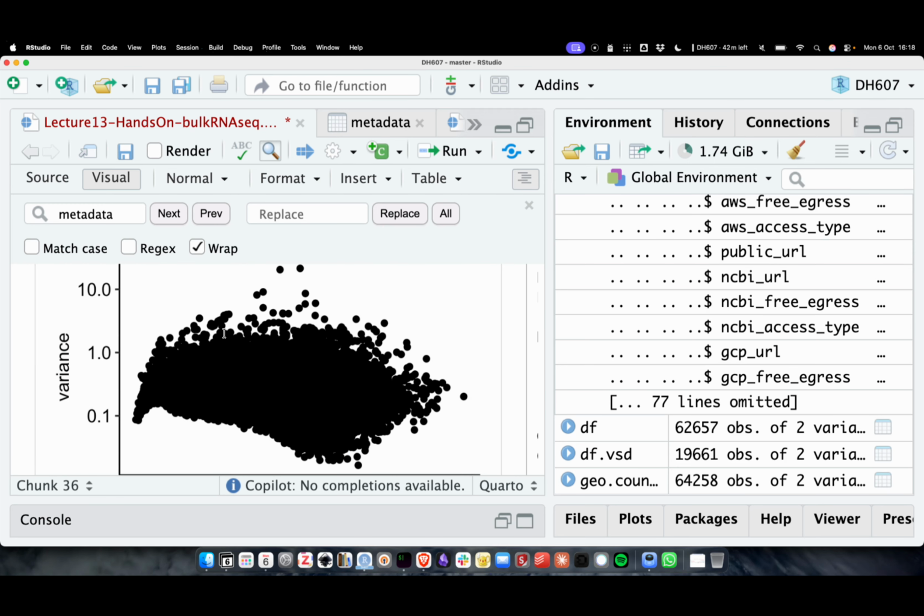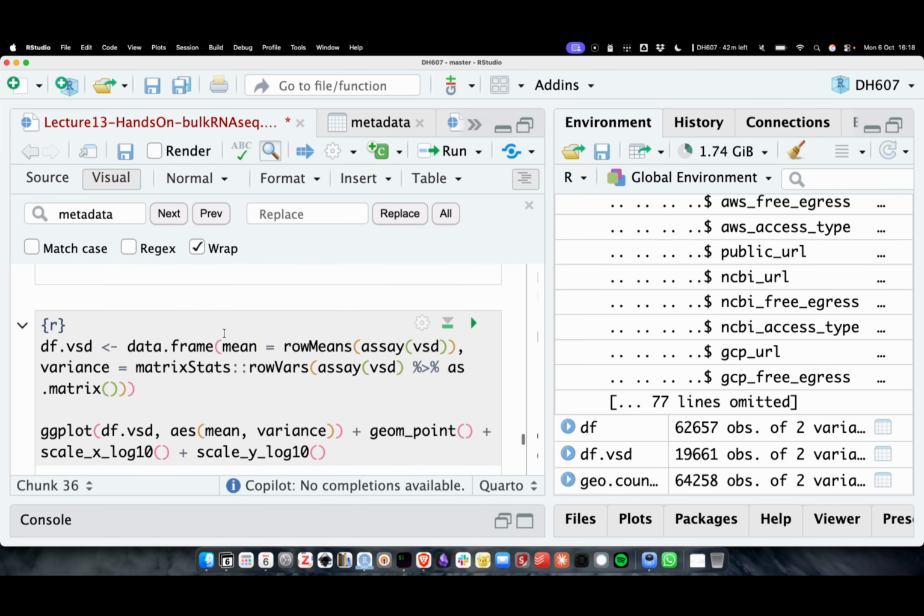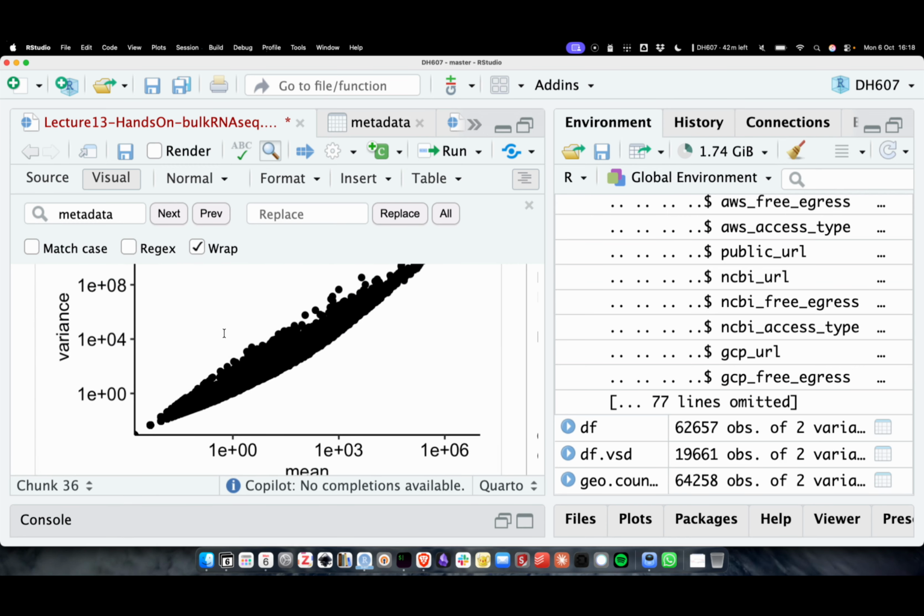The reason this is important is that if you want to do any exploratory analysis with a dimensionality reduction method, for example PCA, principal component analysis, its underlying assumption is homoscedasticity, which means that the variance is not a function of mean. That's why there is a standardization step required there. We have not covered PCA in this class yet. We will do it in the lecture.